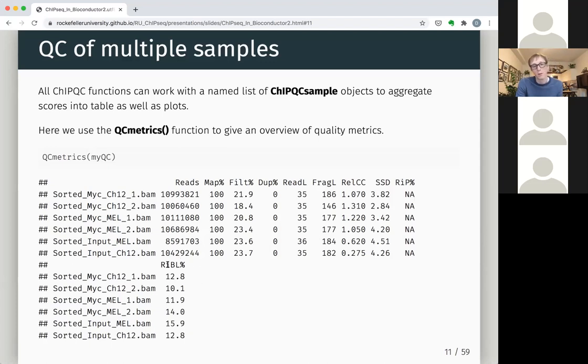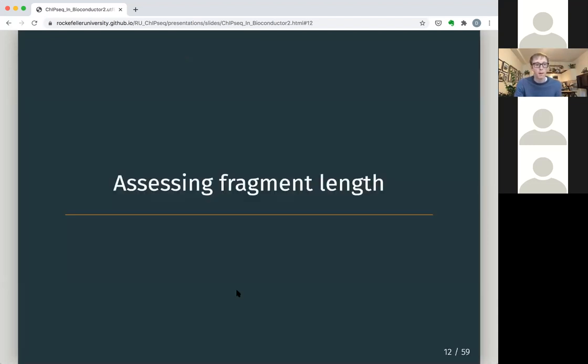And this is the percentage of reads that go to the blacklist. So you can see already that this is not abnormally high, that a large percentage of our reads are not going to these blacklisted regions. With that said, there are still many, many reads, 85, 90% of reads, that are still available for us to analyze in a meaningful way. But this is at least a good metric to catch. If this number was 60 to 80%, that would obviously be a problem. So it's good to at least know.